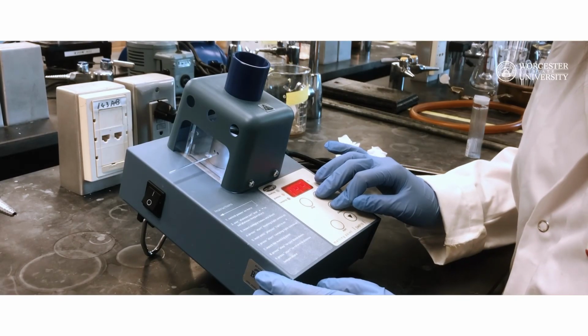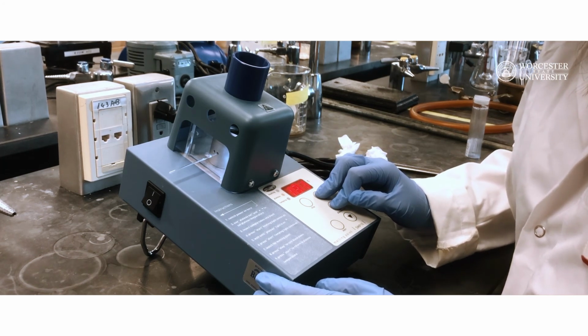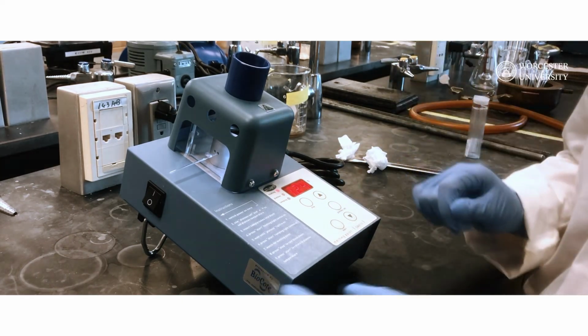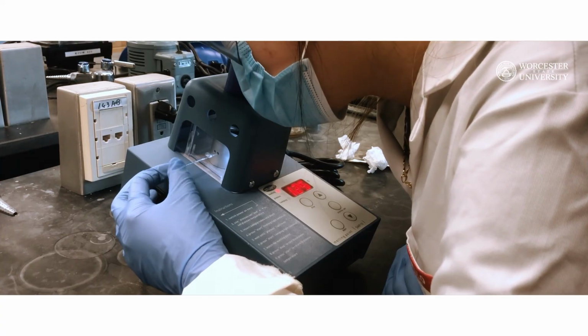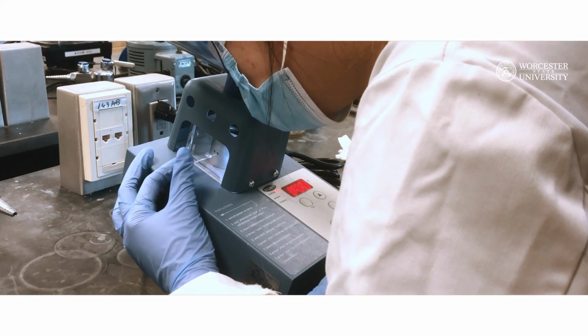This is a new compound and we don't know its expected melting point range. In the first trial, we set the plateau at 200 degrees Celsius. While the apparatus is heating up to 200 degrees Celsius, we observe the melting process from the viewing tube carefully and find that the sample melts roughly at 145 degrees Celsius.